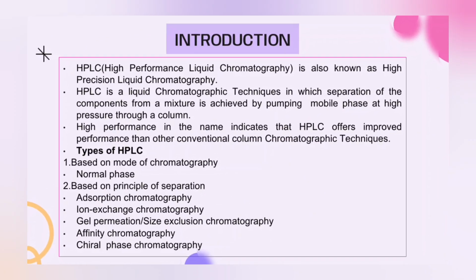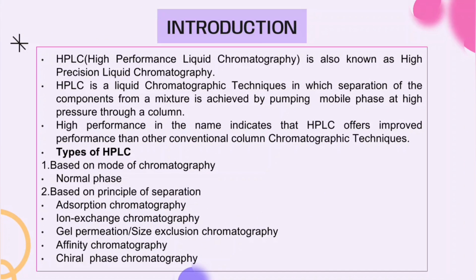Coming to the introduction. High performance liquid chromatography is also known as high pressure liquid chromatography or high precision liquid chromatography. HPLC is a liquid chromatographic technique in which separation of the components from a mixture is achieved by pumping mobile phase at high pressure through a column.